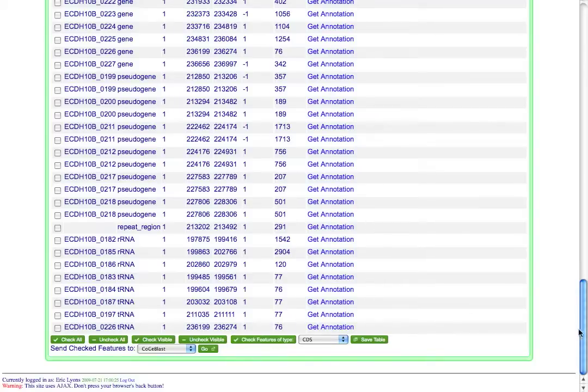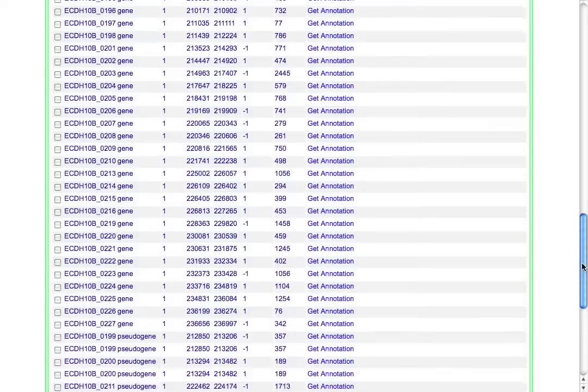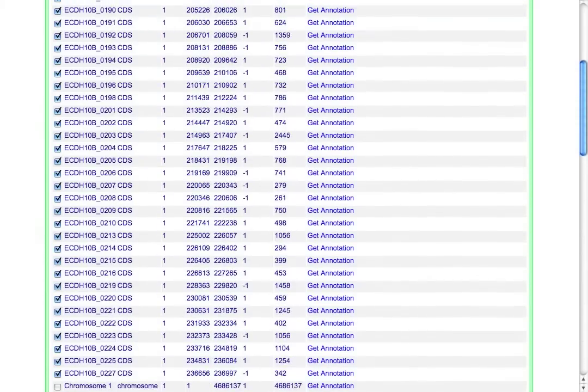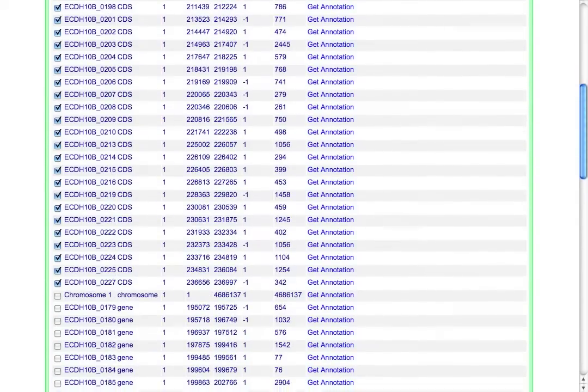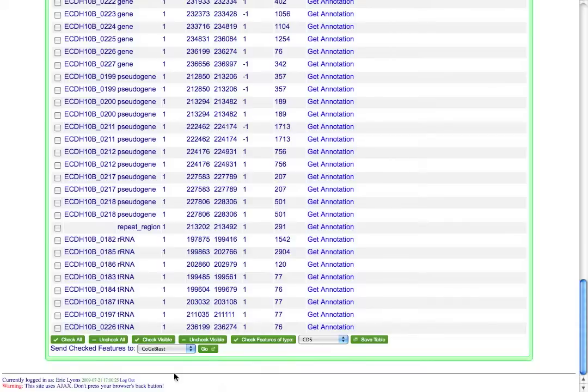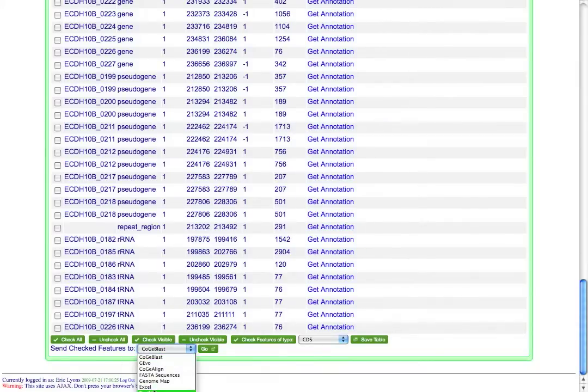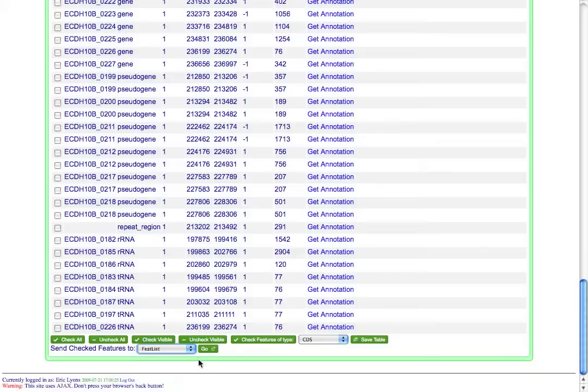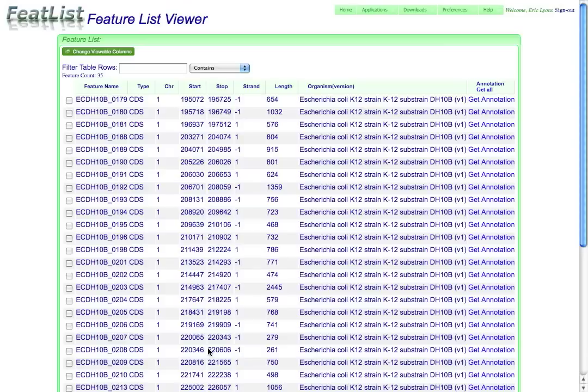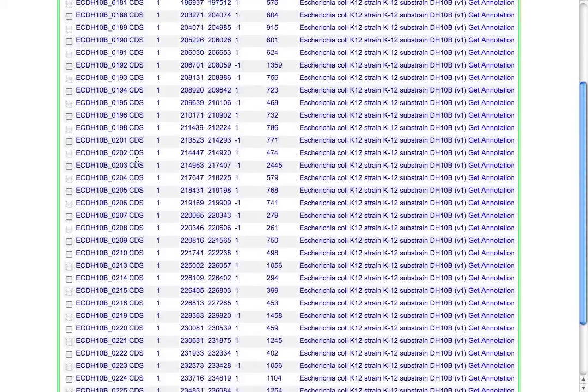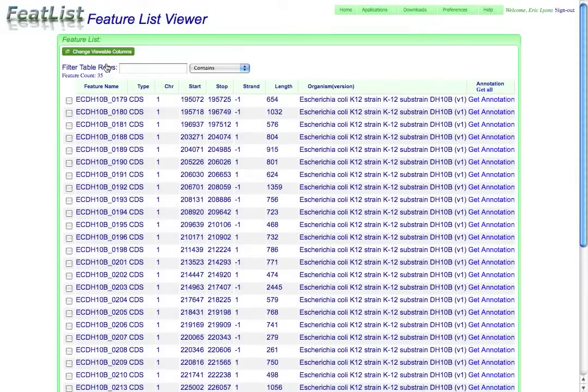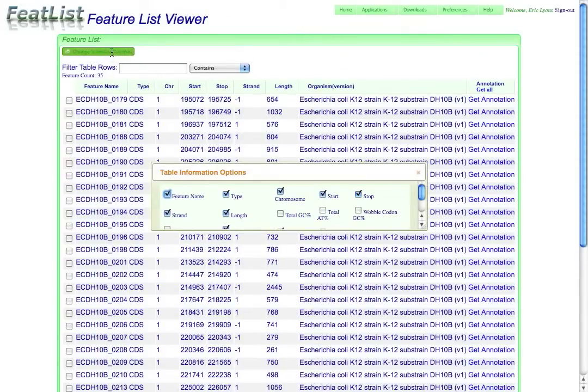So once I've selected that, all the CDS features have been selected, as you can see up here at the top, and then I can send those to a whole bunch of other tools, including back to FeetList again. So I'm going to regenerate this list just looking at the protein coding regions. So here's now a list that has only 35 features that are all of type CDS, which is protein coding.